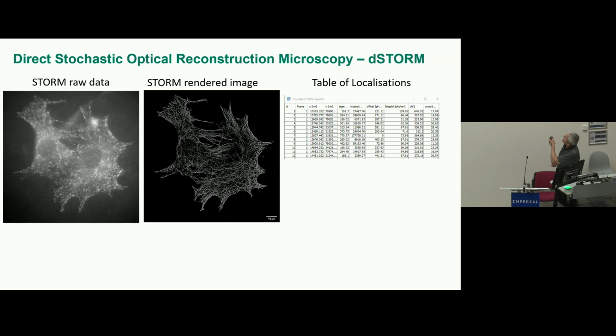Now, this is the actual raw data. For every single point, we get the X and Y coordinates. All computer vision algorithms are based on a different model, but under this technology we have a new way to analyze this. And here is the other challenge, where we need HPC: instead of using conventional computer vision algorithms, how to move into this format where you have the coordinates of every single molecule in your field of view.